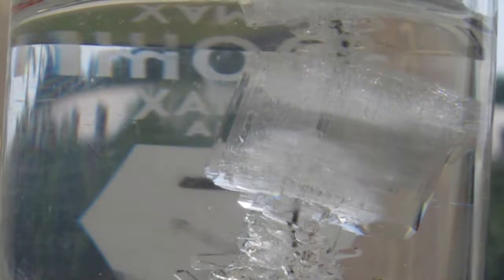Once the water is heated and the salt is completely dissolved in the water, I would pour some of the water into a vial and allow it to cool with the permeable sheet on top, such as a Chem wipe. As the solution cools and the water evaporates, the crystals should begin forming on the surfaces of the vial.